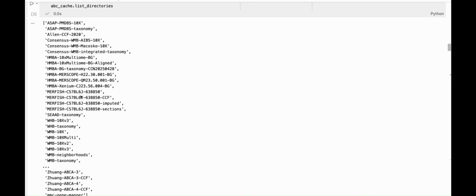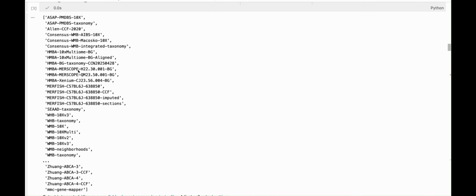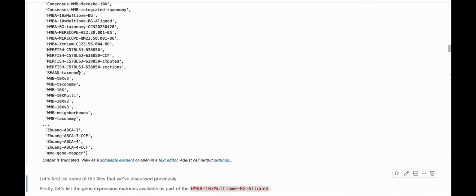If you want to know more about all of these data sets, the landing page at the start of this tutorial is where you want to go to learn what is in each of these folders and what project it joins up to. There are also tutorials that will walk you through how to use and link these together on that same landing page. Okay, so then we have all those listed.